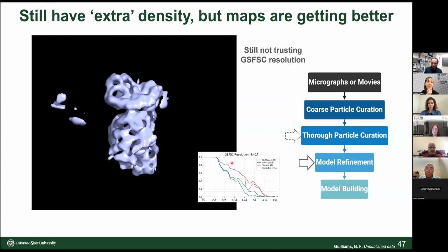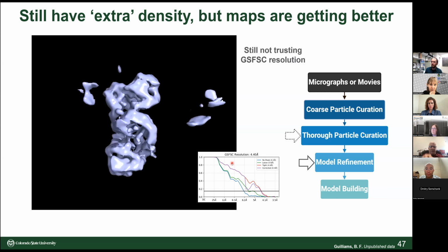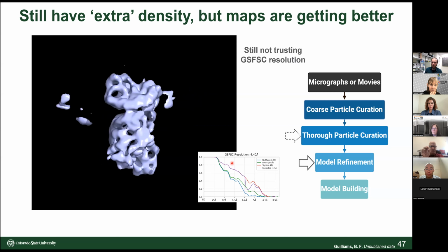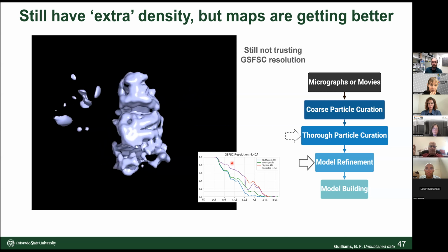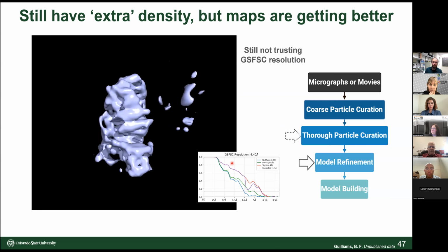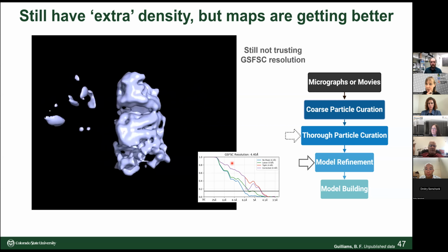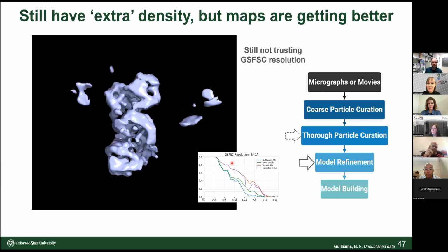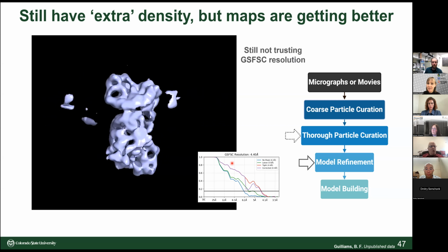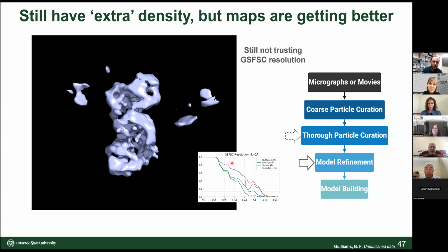Another one of which is when you're doing this rotation, I see that certain directions are stretchy and other directions are much more sharp. That would of course also say, okay, look at the distribution of the angles that the data was collected, and that should give you a clue. Oh, maybe you have either preferred orientation or you just threw out everything except one orientation. It's not preferred orientation. It's just you selected only one orientation, and that's what you did the reconstruction at.